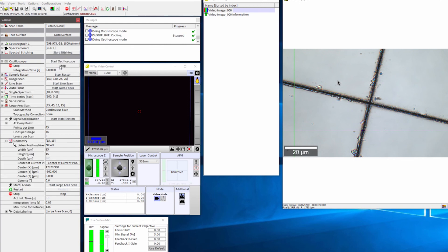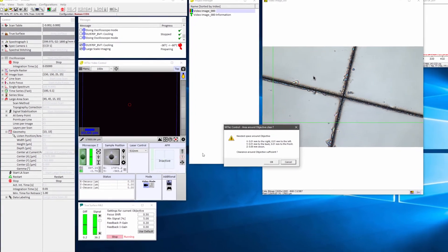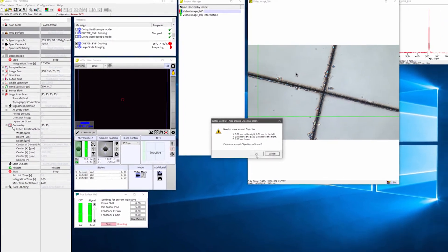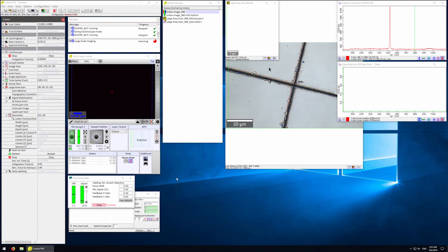Let's stop the oscilloscope. Now we can start the large area scan. Confirm that you have sufficient clearance and click OK. The imaging has now started. It will take a few minutes.